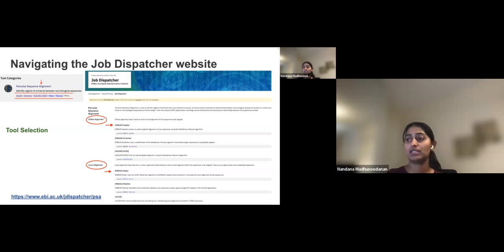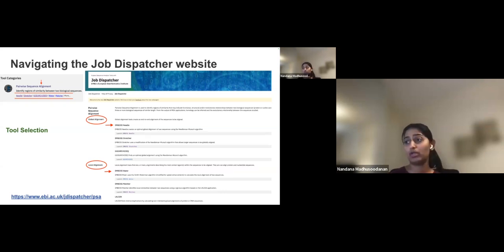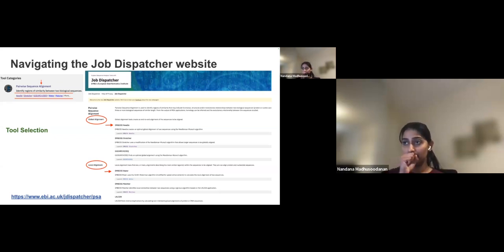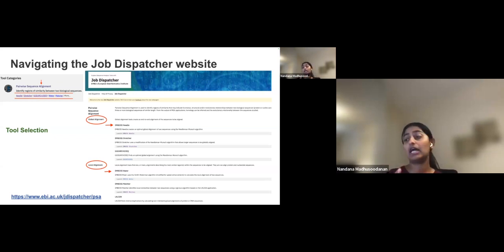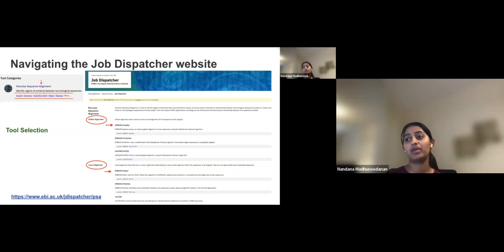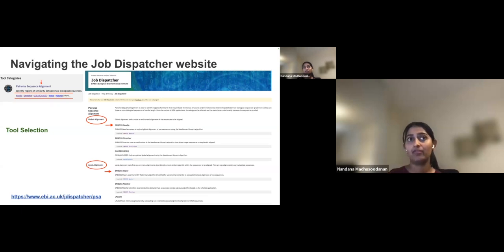Here you can see tools for global and local alignment. If you are interested in the entire sequence length — for example, comparing a homologous protein or nucleotide sequence between human and mouse — you perform an end-to-end alignment and go for global alignment. If you are interested in particular regions with higher similarity, such as conserved patterns or motifs, you would use local alignment tools. Note that there is a file size limit for every tool.